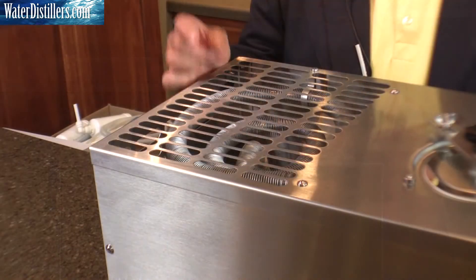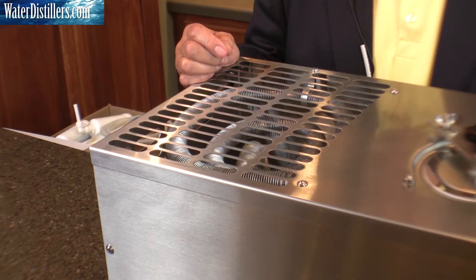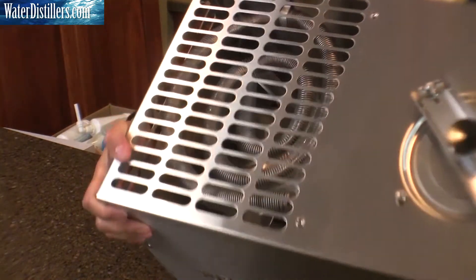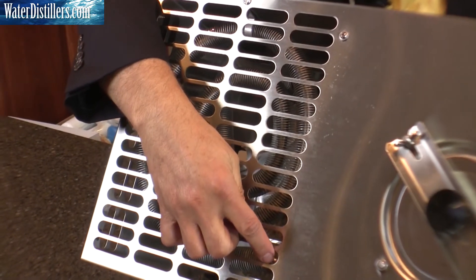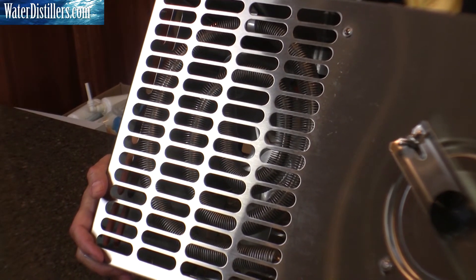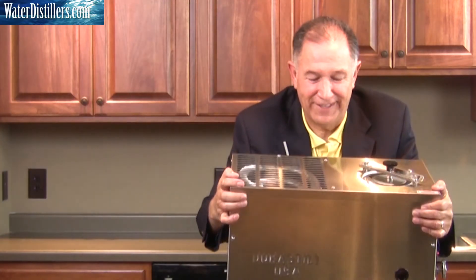I want to tip it over slightly so you can see something that's engineered to be this way — it's called a gas escape portal. At the top of the serpentine coil, if I tip this over just slightly, you'll see a very small hole at the very top. That's engineered to allow the volatile gases to escape. There's no worry about that — it's the way it's designed.